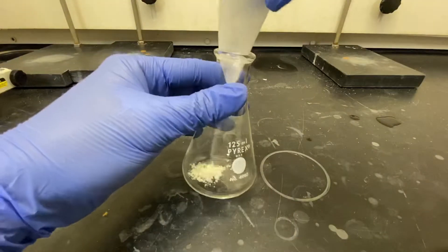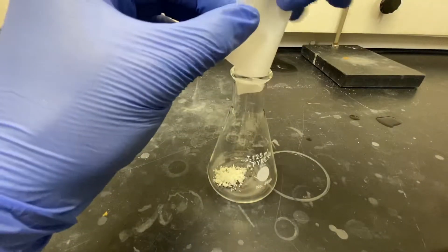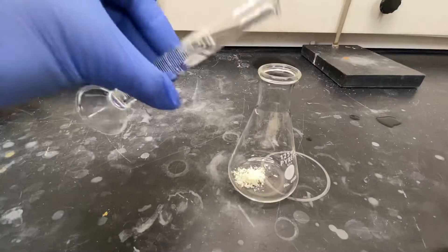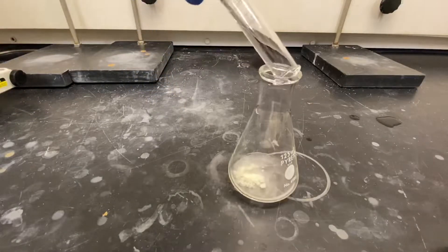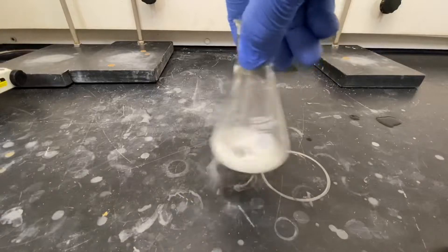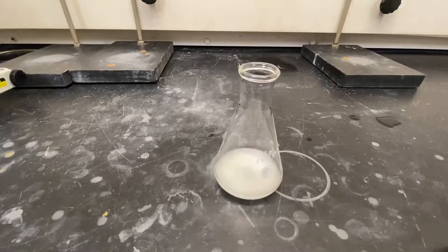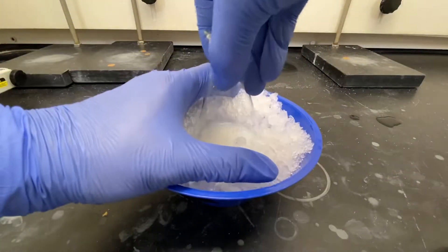Transfer the chalcone into an Erlenmeyer flask and add 14 milliliters of methanol. Swirl the mixture to suspend the chalcone, and then cool the mixture in an ice bath.